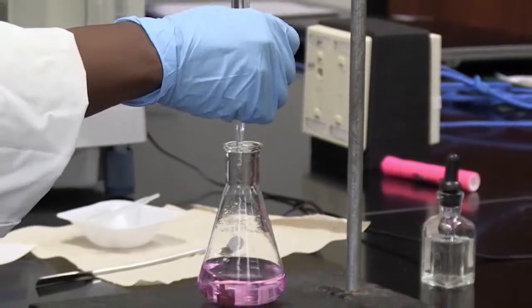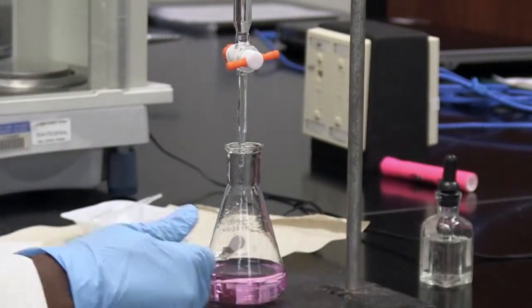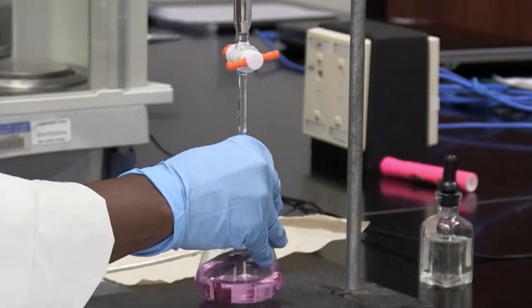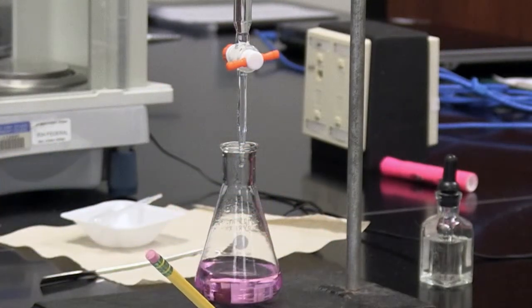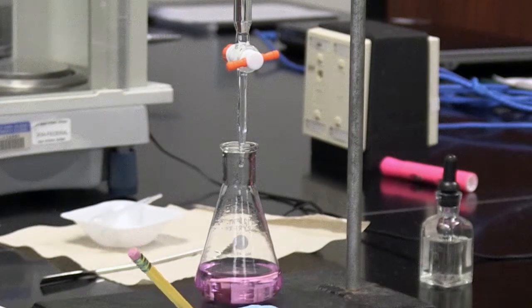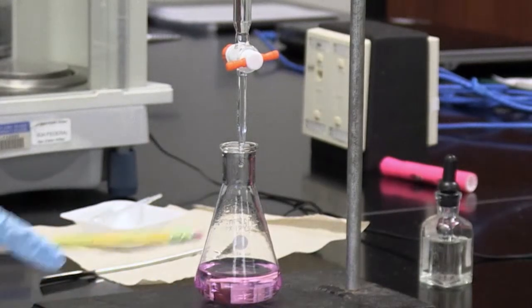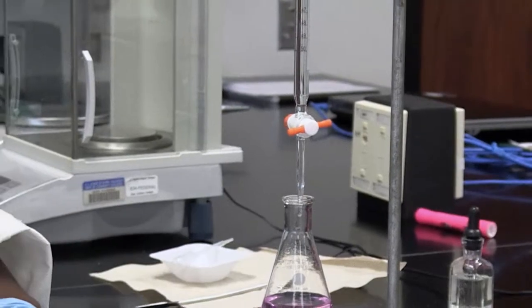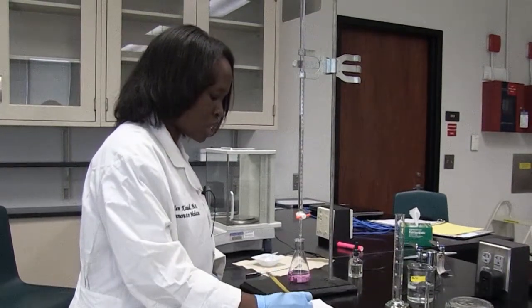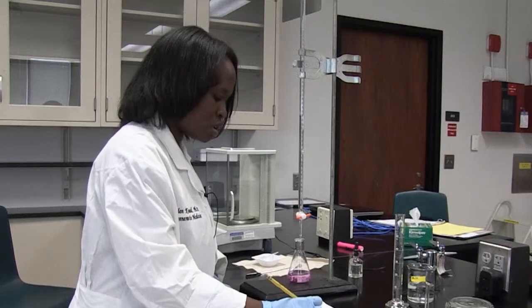I got a pink color and if I were to record this — the pink color actually stayed. So this is a trial run. I recorded the volume at which I first saw pink and it actually remained. The final volume, reading from the burette, would be 31.7 mils. I can determine the volume of sodium hydroxide added by subtracting the initial burette reading from the final reading: 31.7 mils minus 10 mils gives me 21.7 mils of sodium hydroxide.